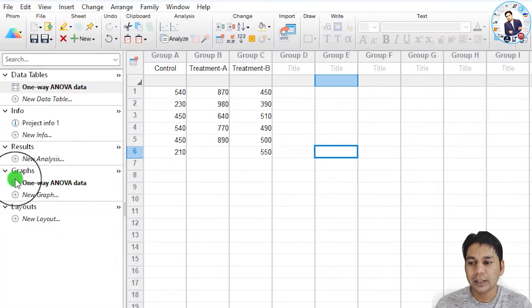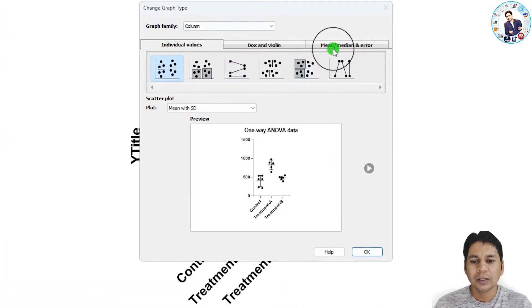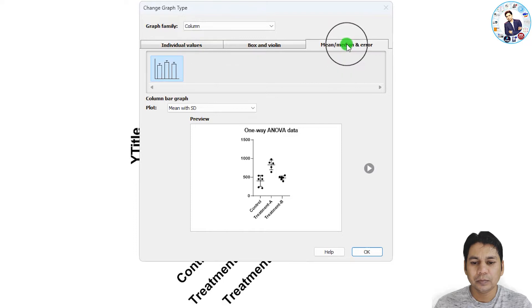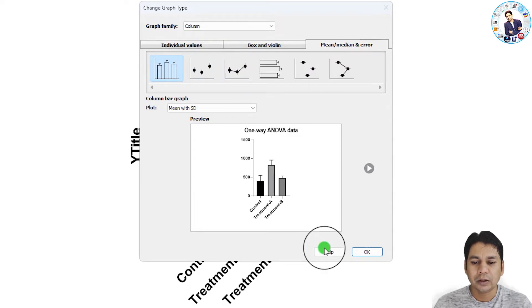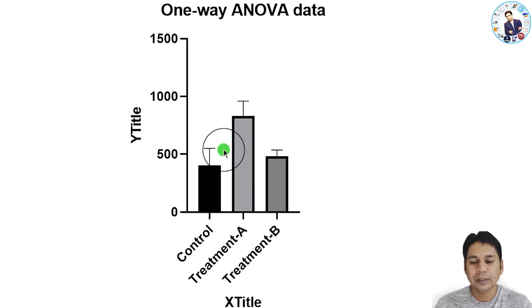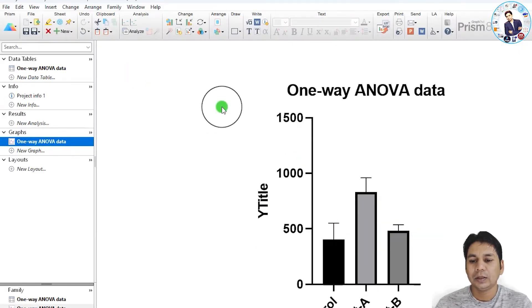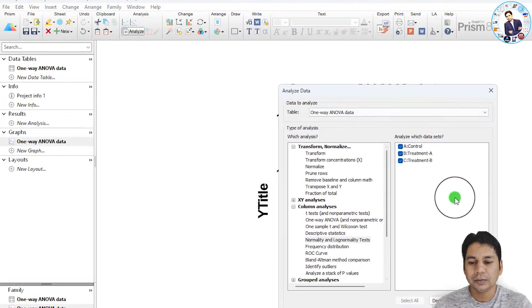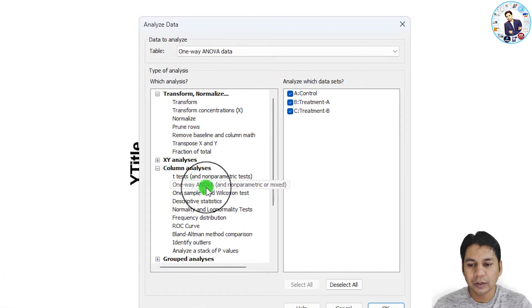Before running the analysis, you can view a graph of your data. Click on the graph option and select your preferred graph type. Here I am selecting the mean, median, and error bar column graph. You can now see the graph of the entered data.